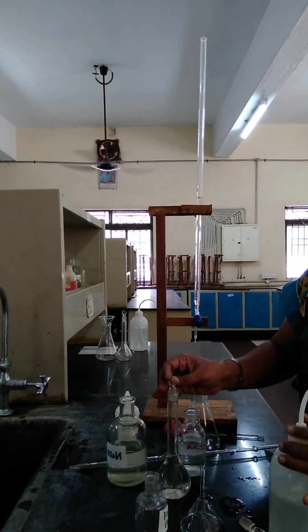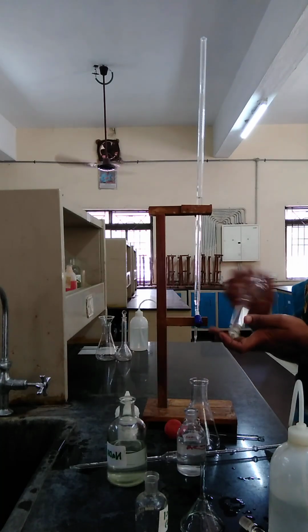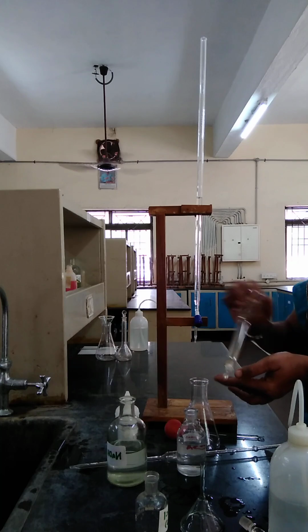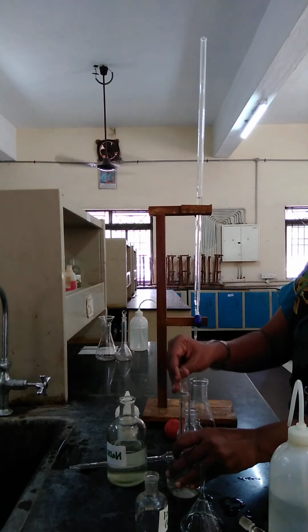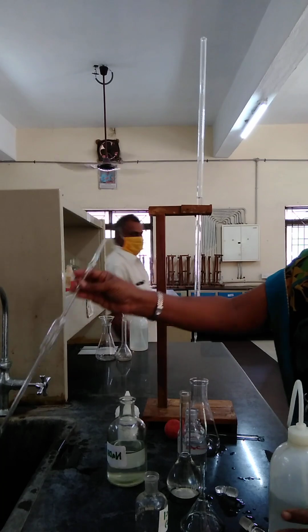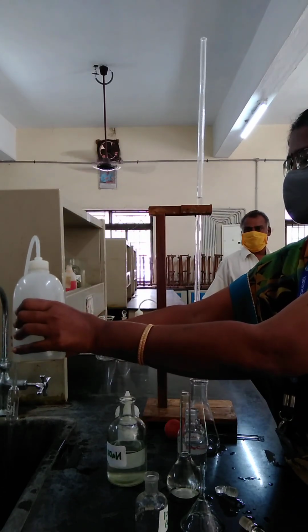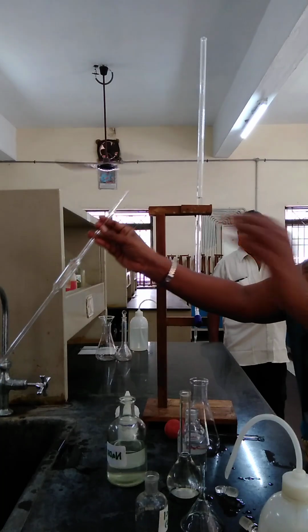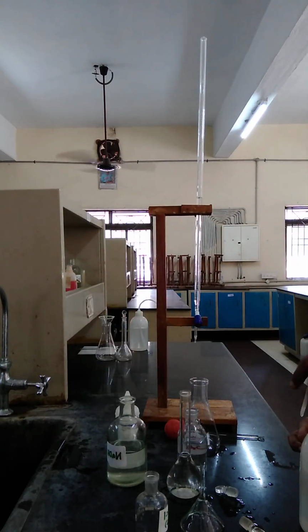You can pick out the distilled water for the final makeup. Now we shake very well to get it homogeneous, because after the neck, when you add distilled water continuously, sometimes the top layer may be less concentrated, even though it is completely miscible in the water medium. So you have to shake very well before making up completely to the mark.